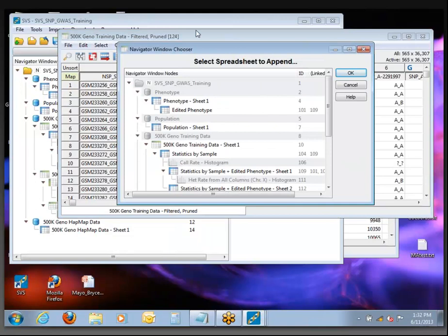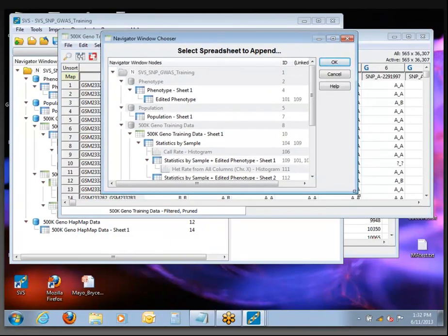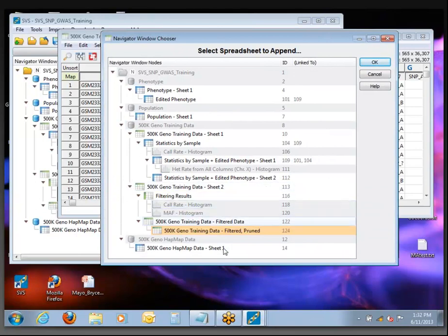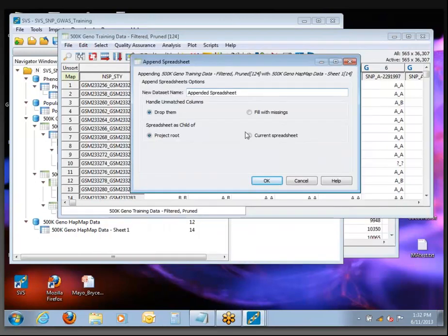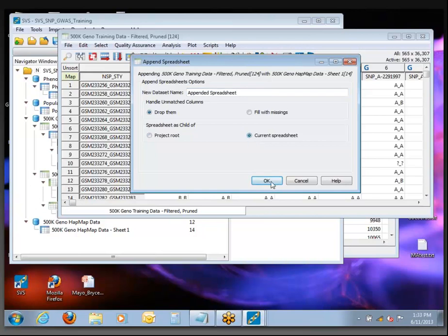In the Append dialog, the first thing it asks is to select the spreadsheet to append with — we'll grab the '500k Geno half map data'. Click on it and click OK. Then it asks for a new data set name — I'll just leave it as 'appended spreadsheet'. For unmatched columns, we want to drop them so we'll just get those same 36,000 columns but with genotype calls from both spreadsheets. We'll put it under the current spreadsheet and let this run.